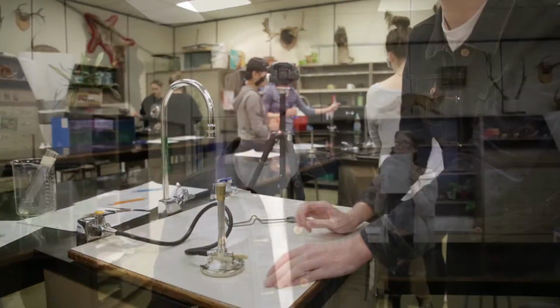My theory is that if we put it over the heat, it will boil and then steam will start to come off, and it will have a gas that will start to smell, because the steam is releasing gas into the air. My theory is that solution A, when heated, will possibly bubble at a high enough temperature and release little to no smell. My reasoning is that things that have a pretty terrible smell are often flammable and dangerous around heat, so I feel like that would be the type of solution we'd be testing.